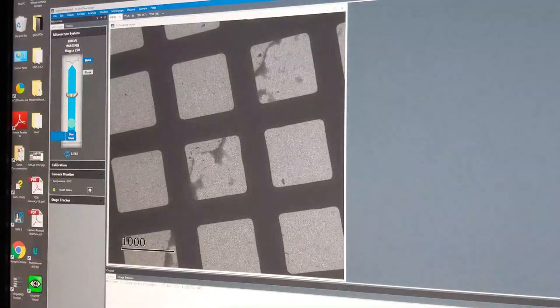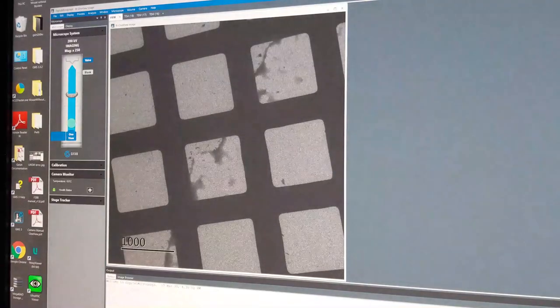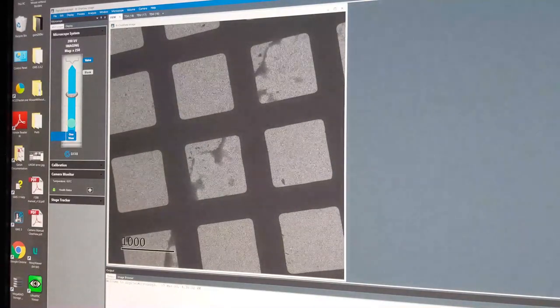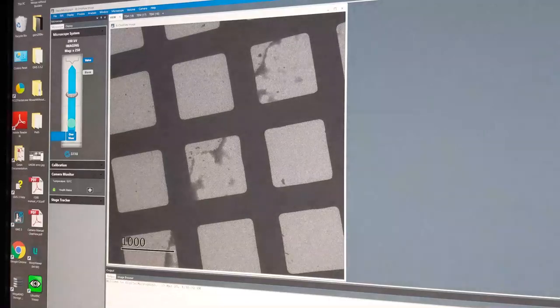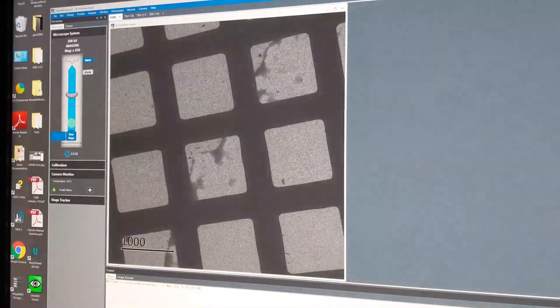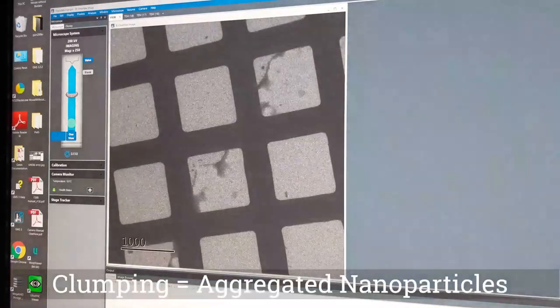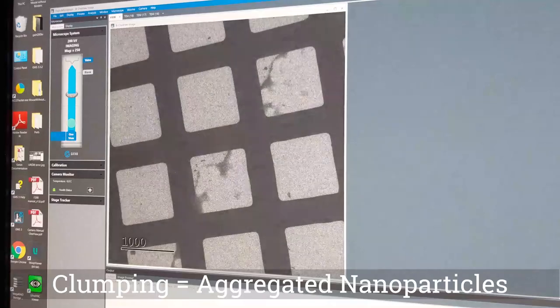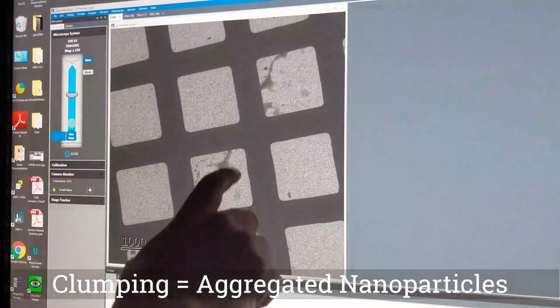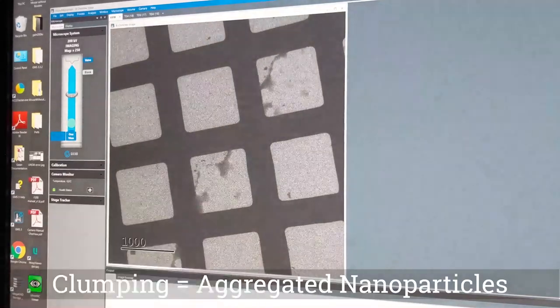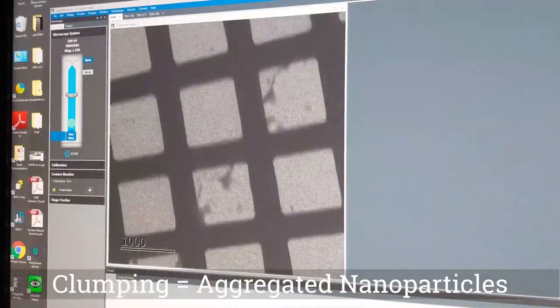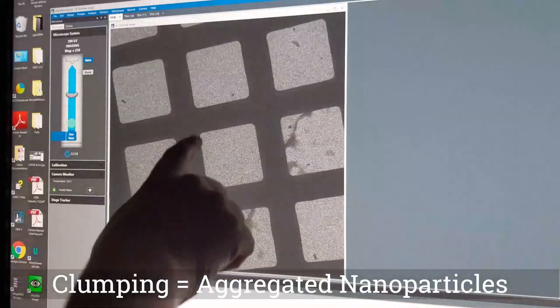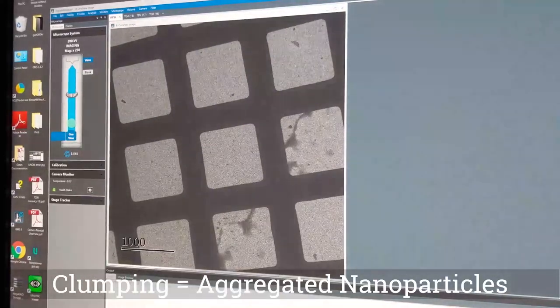However, in the sample preparation we wanted to get a single thin layer of the gold particles — not clumping. And this is evidence of clumping, so we will ignore that region and concentrate on a region such as this one.